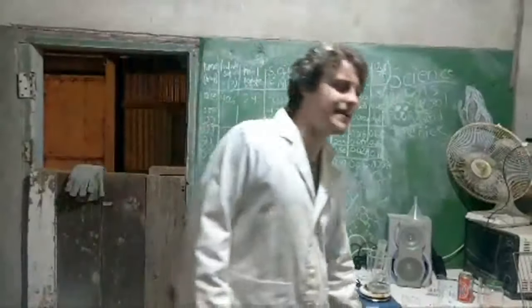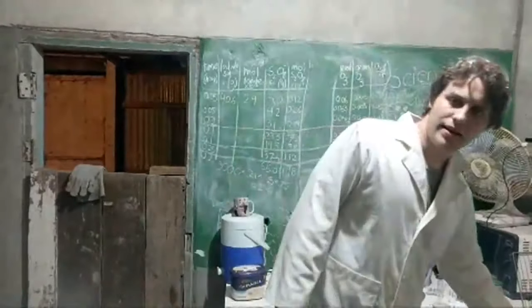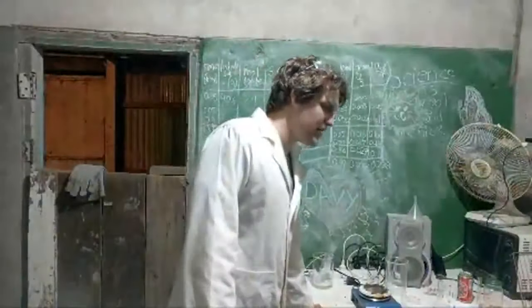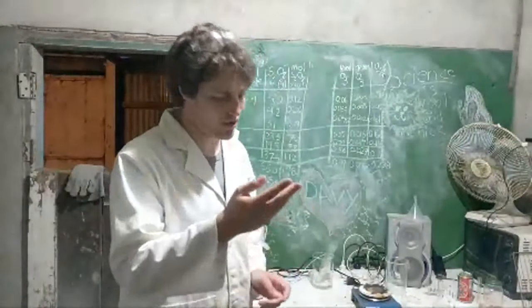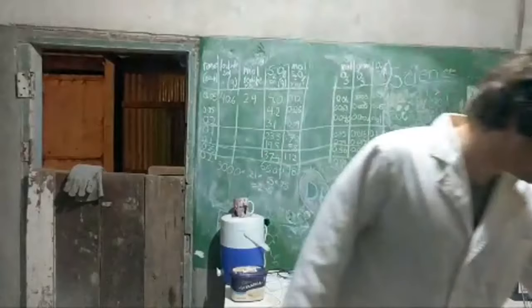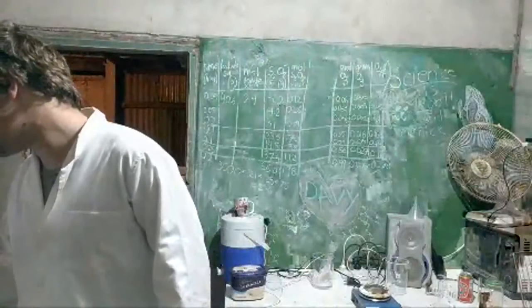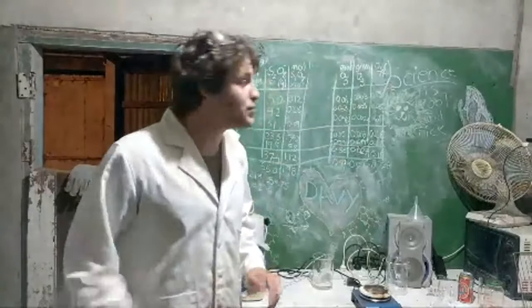Today we're going to be trying to make ferrates, which is high oxidation state iron, so it's iron 6. Which is really cool, and ferrates are not very stable. While they're possibly quite strong oxidizers, they tend to not find much use because they are not stable in acidic solution at all, very quickly break down, and even water in the air tends to break them down, so in a normal synthetic lab they will just break down. But I'm interested in trying to get them to do some reactions, possibly. So if we make some, then at least we can play with them and see if it works or not.